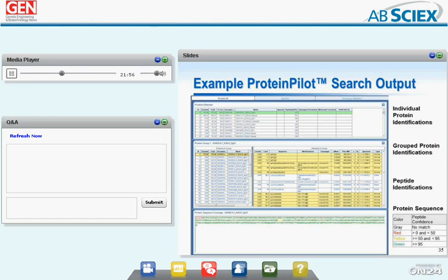In this example, we see very good sequence coverage of this protein target, and this database was searched using a lot of germline database information, so there are a lot of homologous protein identifications.